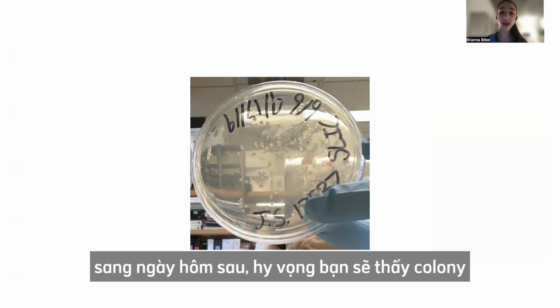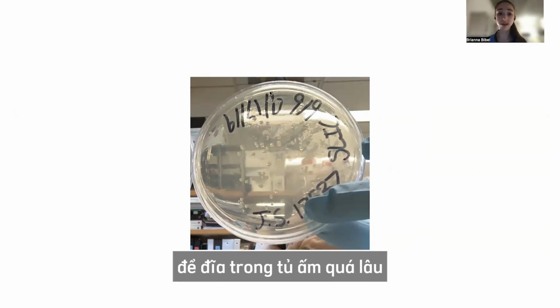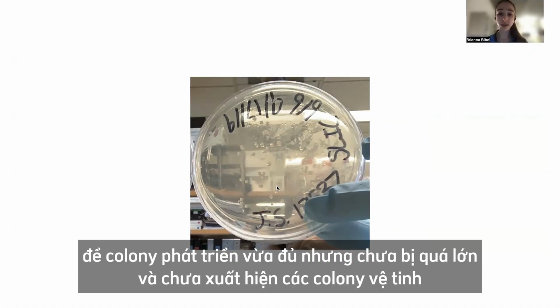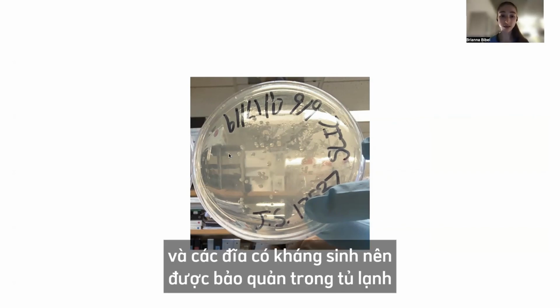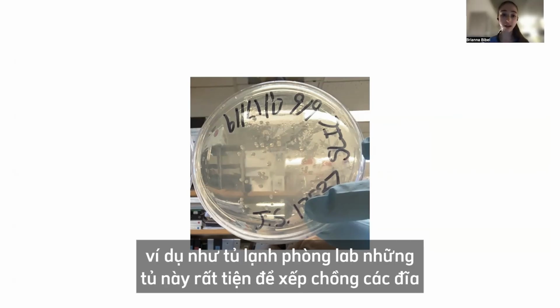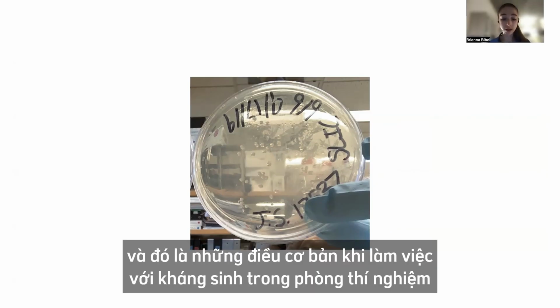And then the next day, hopefully you'll see some colonies, and you don't want to leave your plate in there too long. You want to leave it in there so that you have these nice biggish colonies, but they're not getting overgrown and you're not starting to see the satellite colonies, because remember, the antibiotic is going to be degrading in these plates. And so typically too, when you have your plates containing antibiotics, you're going to want to keep these in the fridge. So say in one of those deli fridges, if you have one, they're really nice because you can keep these stacks of plates. But that's the basics of working with antibiotics.